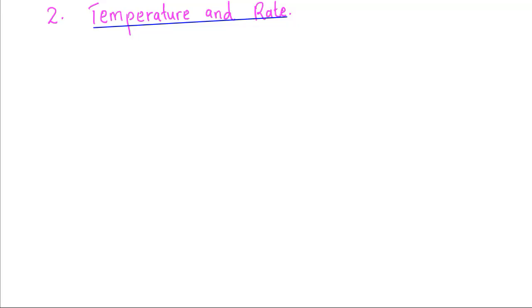After discussing the first factor affecting rate of reaction, that is concentration, let us today talk about temperature as another factor affecting reaction rate. An experiment. Procedure.